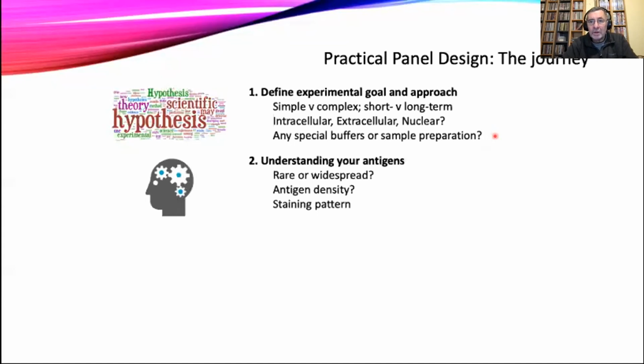We're also going to think about our antigens or our targets. It's not always about phenotyping. This is something we looked at a little bit last time, because this helps us think about which fluorochromes we might use together. So, for example, are our targets on a lot of cells in our sample, or are they only going to be on a few cells? Are we looking for a rare event? Of course, flow cytometry is very well suited for looking at rare events.